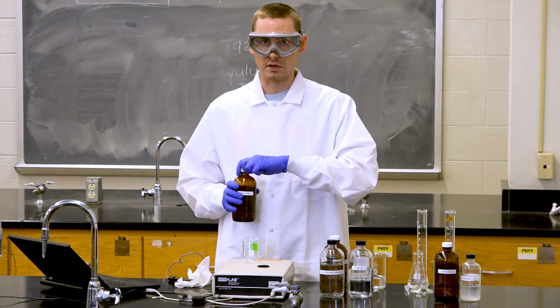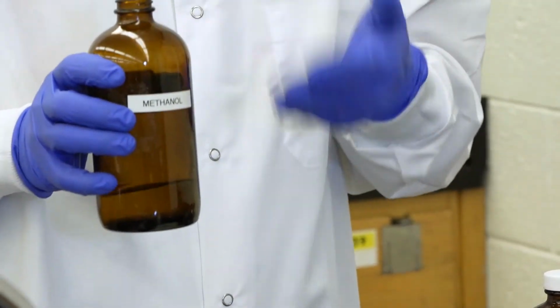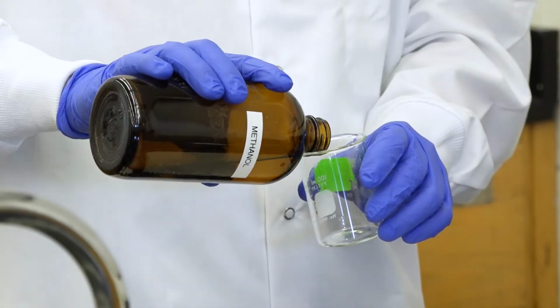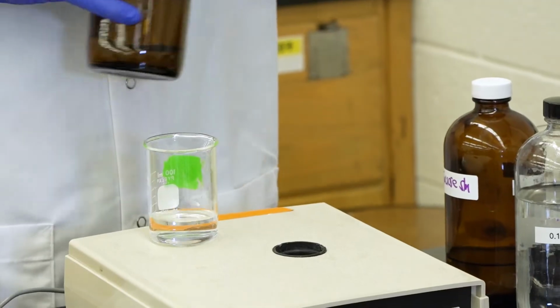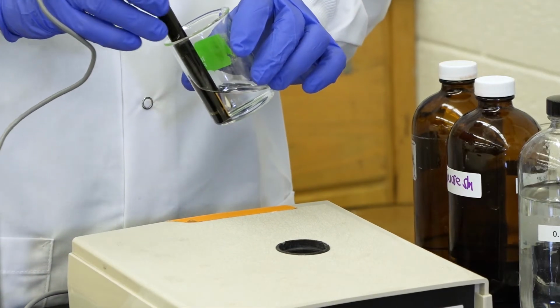Methanol is a polar solvent, meaning that it does carry some charge on the methanol molecule itself. Part of the methanol molecule is more non-polar than the other side, but we will probably not see very much conductivity from this solution because electricity will not move easily through it. So we've added it to a beaker, and then we can put in our probe and measure the conductivity.